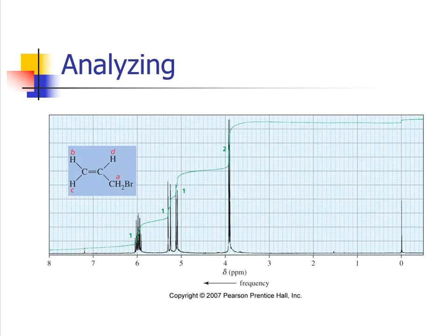Okay, so here's another example problem, and this one does involve a double bond. So if I take a look at the major shifts, I'm looking at maybe 1 and then 2, possibly 3 there, and then 4. So maybe 4 different equivalent hydrogens, or proton types, that we are seeing. And if I look at the structure, sure enough, I see A, B, C, and D. I see 4. So here is A, and of course A would always be the first one. And then B, there's B, and then C is on the same side just down below, and then D is there.